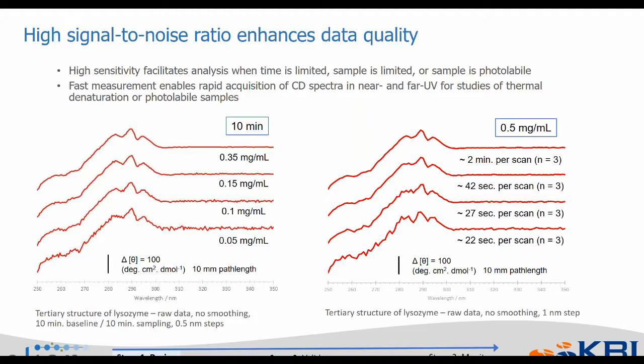Going back to designing the method though, we should be clear at the outset of the method design process what the necessary concentration is for our samples to achieve the level of signal to noise necessary to ultimately get the precision that we need the method to have.